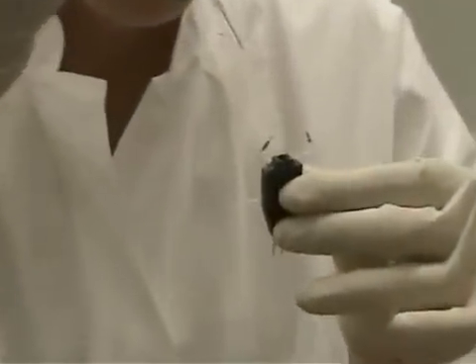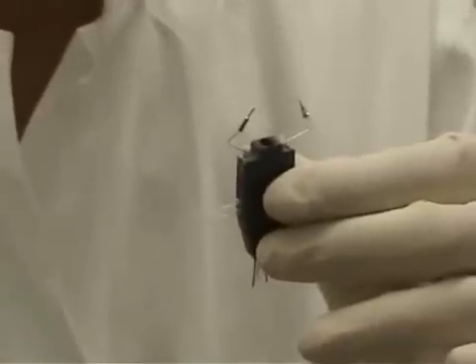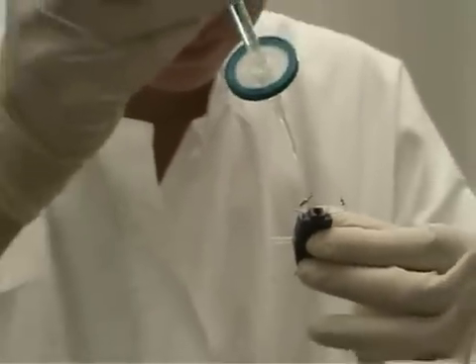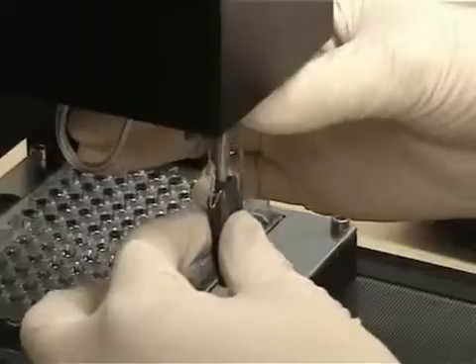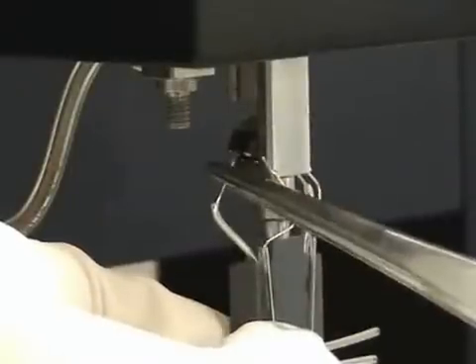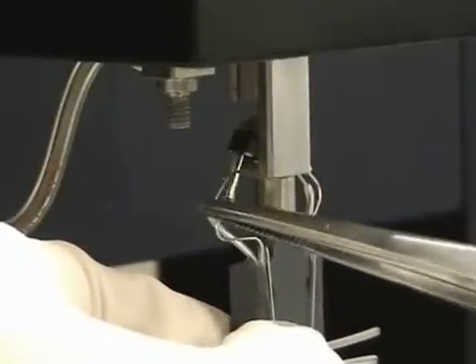The glass electrodes of the ready-to-use measuring heads are filled with the electrolyte before use. The measuring head is put onto the recording axis, and the chloride silver wires are plugged in.